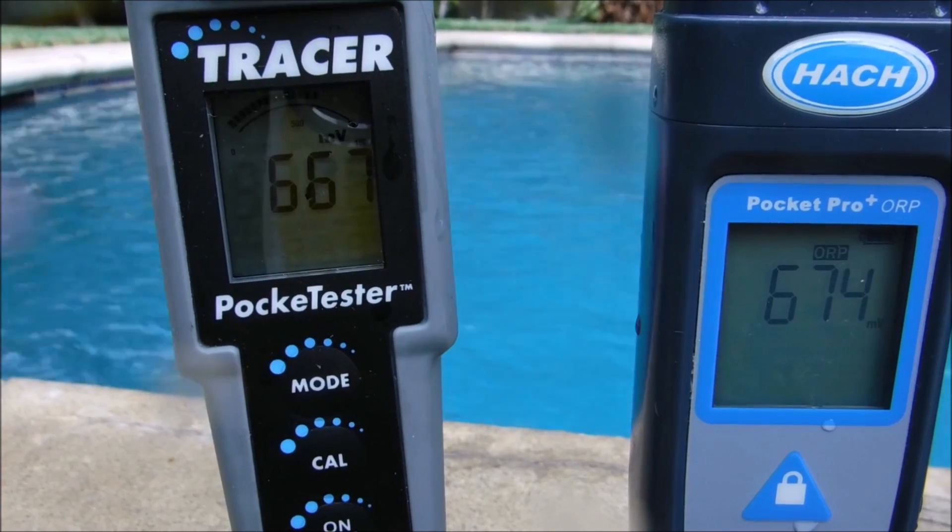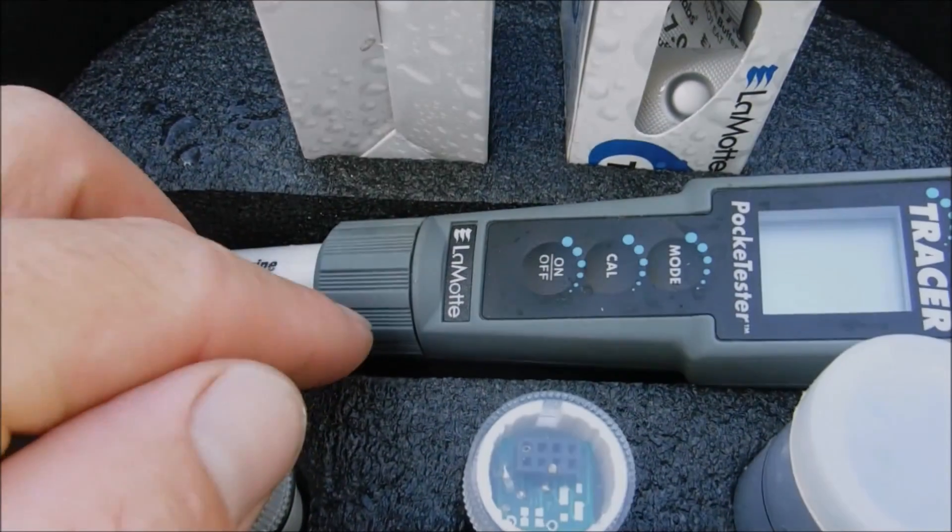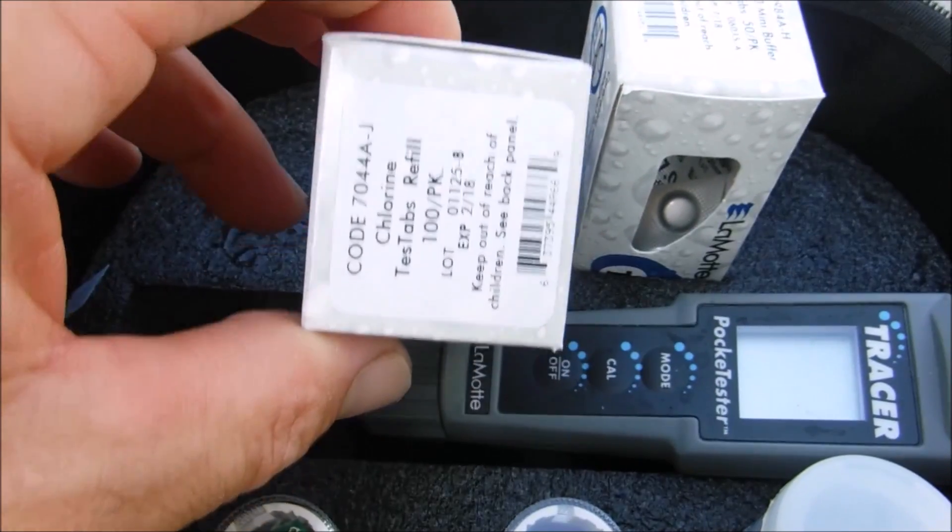The one on the right is still upticking a little bit. This particular model also does total chlorine, and you have to use tablets to get that reading.